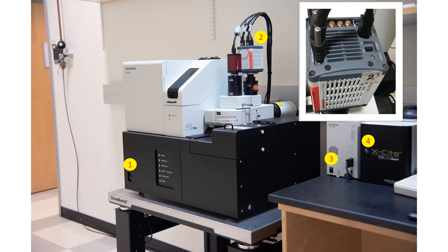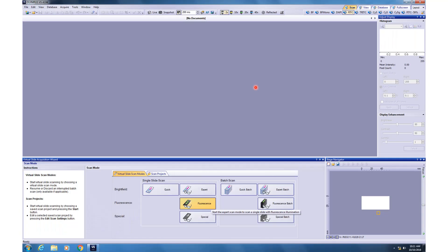Once you have switched on all the components, then you are all set to start the software. Once you have started the software, click on this button highlighted here, the fluorescence button. If you are doing one slide, for the sake of this tutorial, we will be covering only the single slide mode.